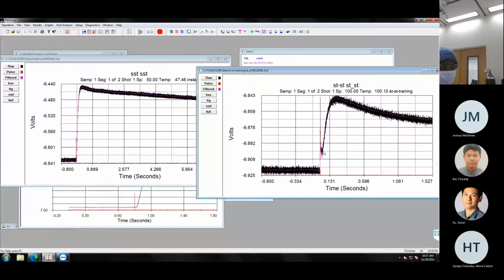And then, in order to improve the properties of paraffin wax, we need to add some additives to that. So those additives act like impurities in the sample. So that's another question, how it can affect the results.